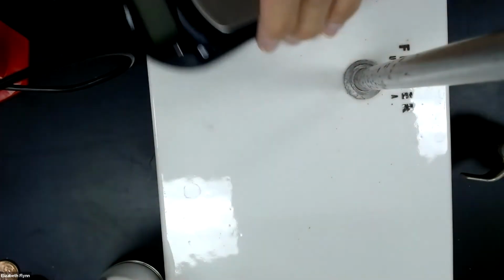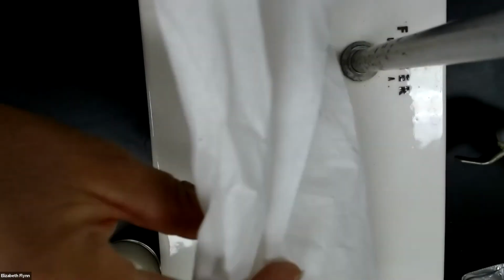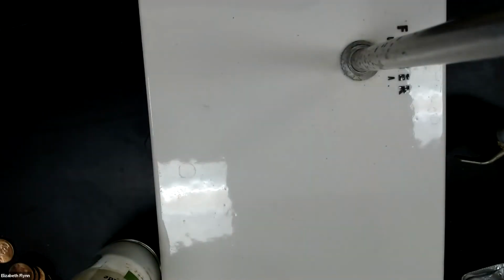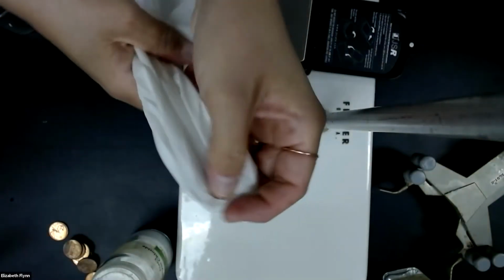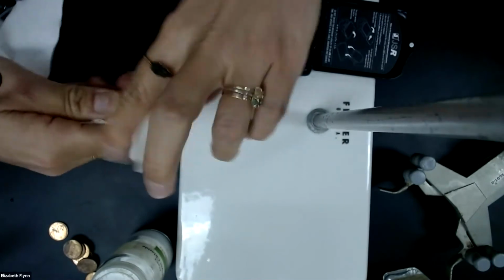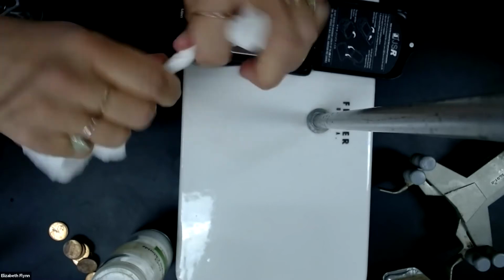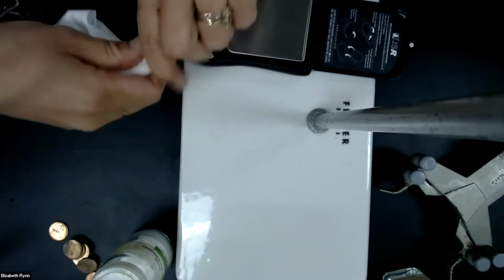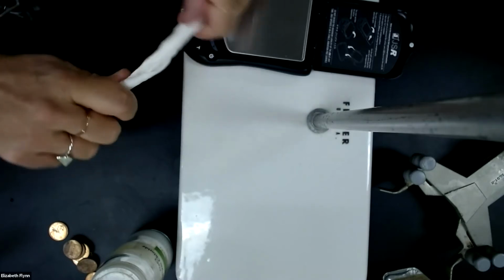You can take some paper towel, a long piece of paper towel, and fold it, and then kind of twist it so that you get a nice long piece of twisted paper towel that you can dry out your graduated cylinder with.